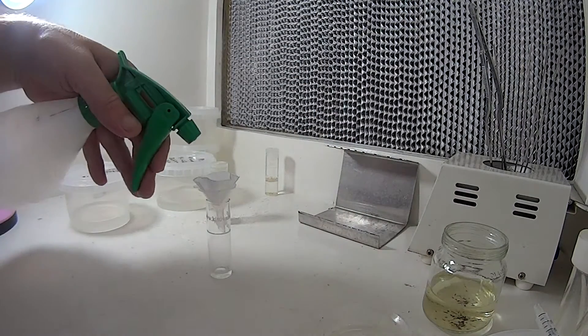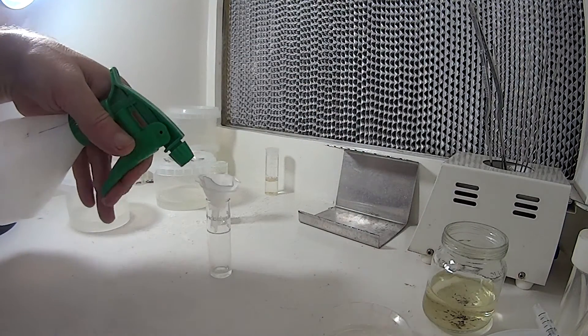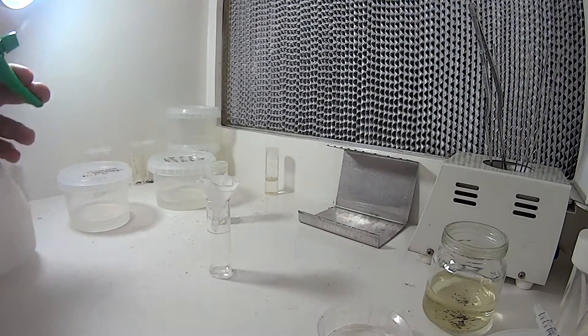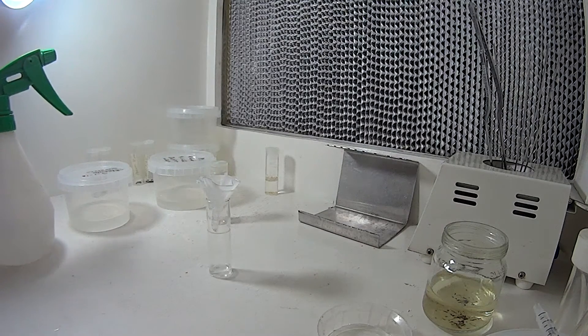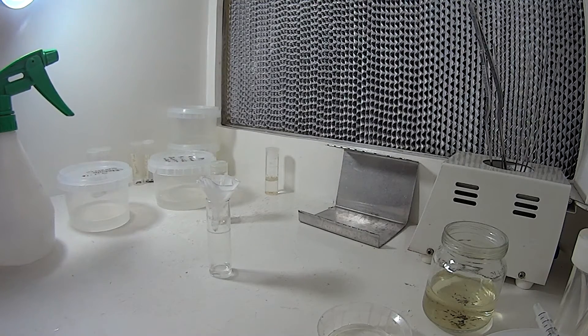So to sterilize that before I use it is just giving it a good soak with alcohol, give it a good soak, let it dry out a little bit, and then give it another go, and we'll come back to that.